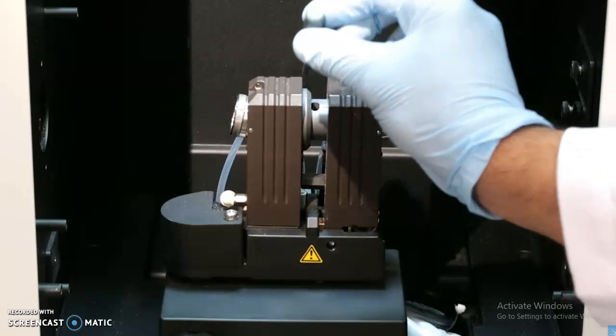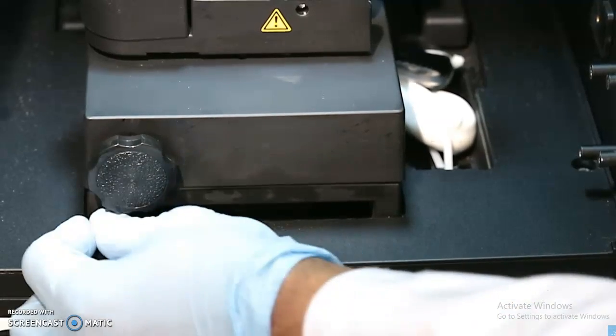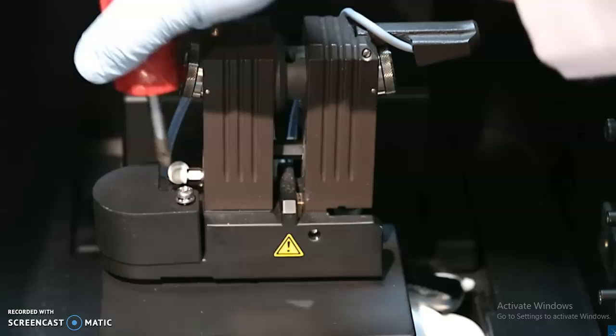Remove the alignment tool and check the alignment of the furnace. Unlock the furnace by moving the locking lever to the left. Remove the vertical alignment cover.